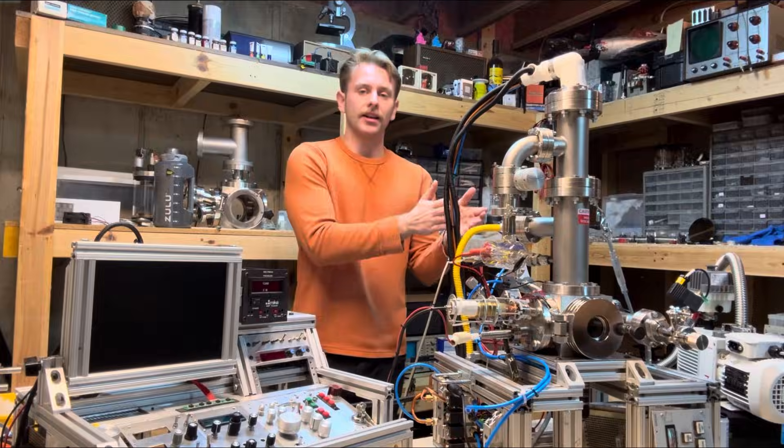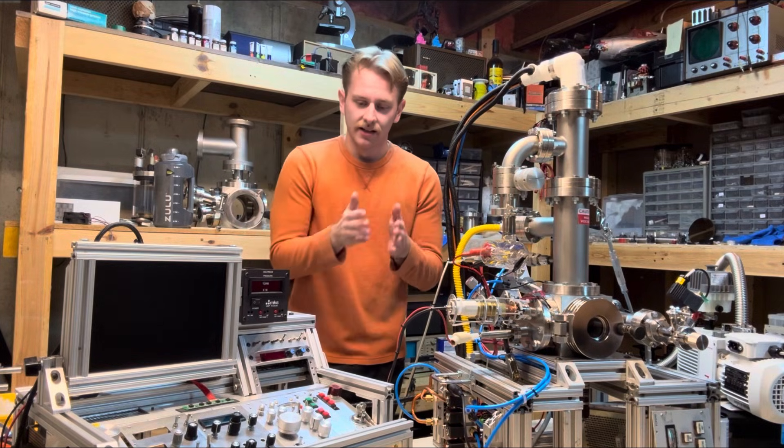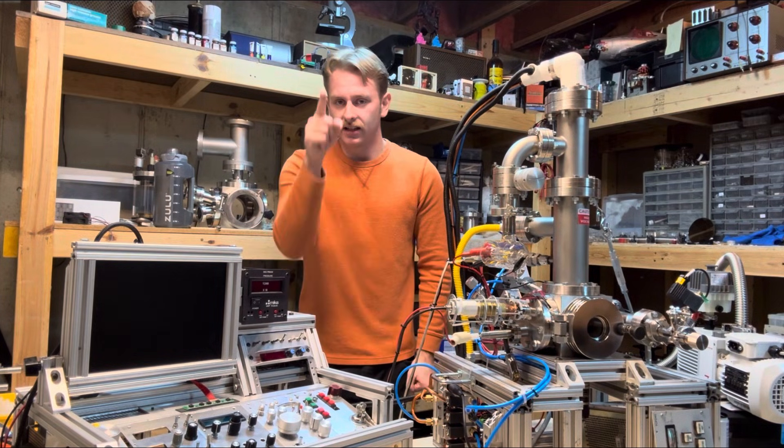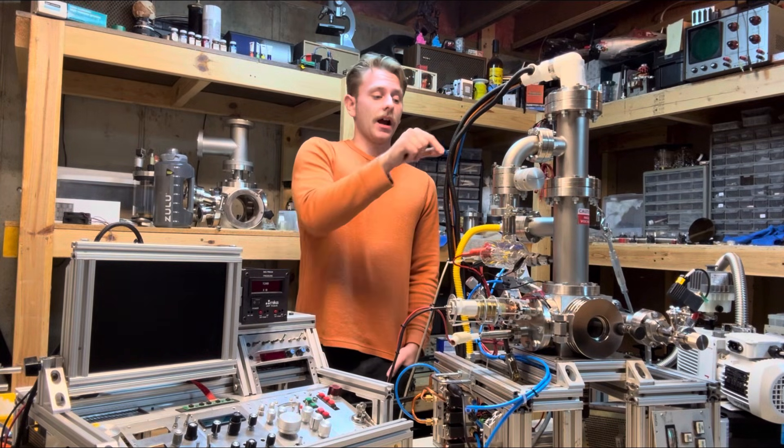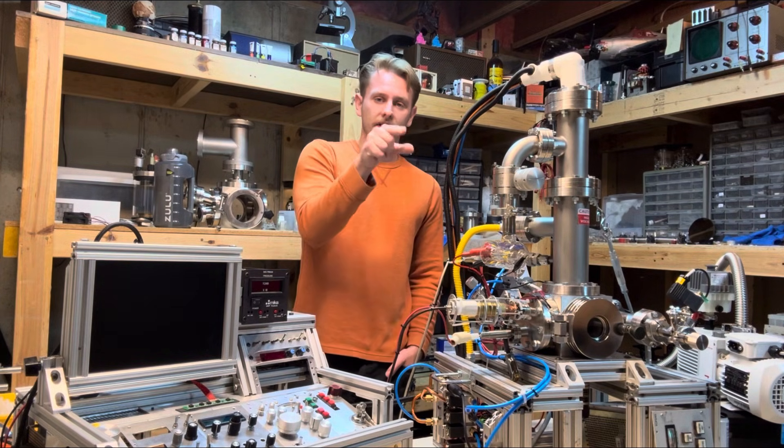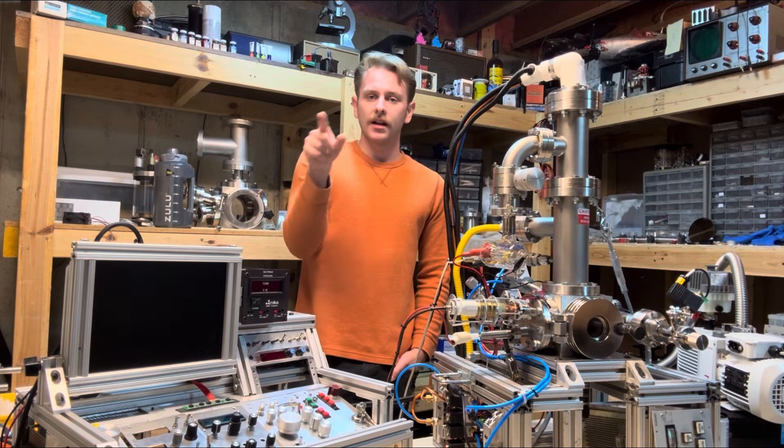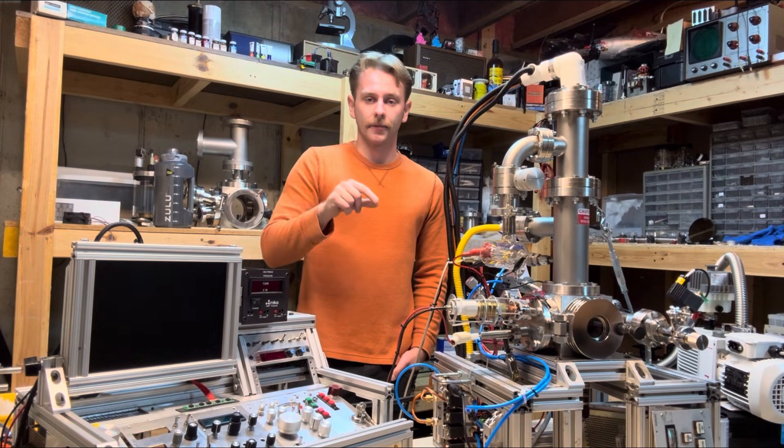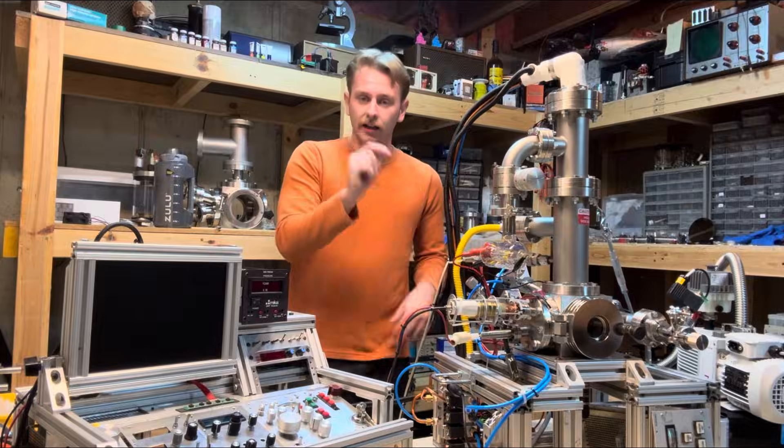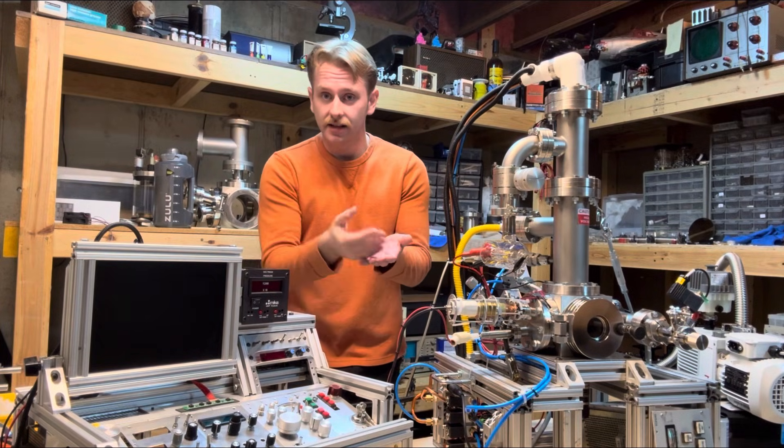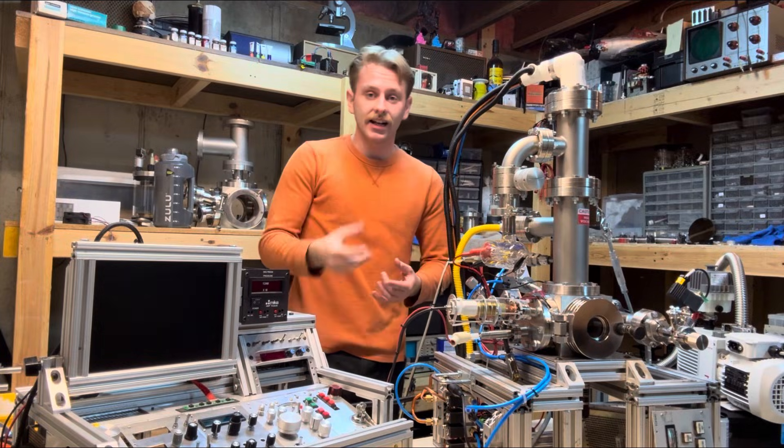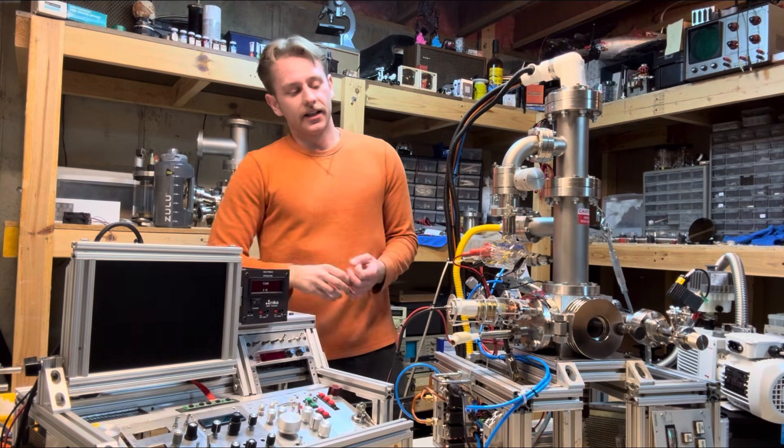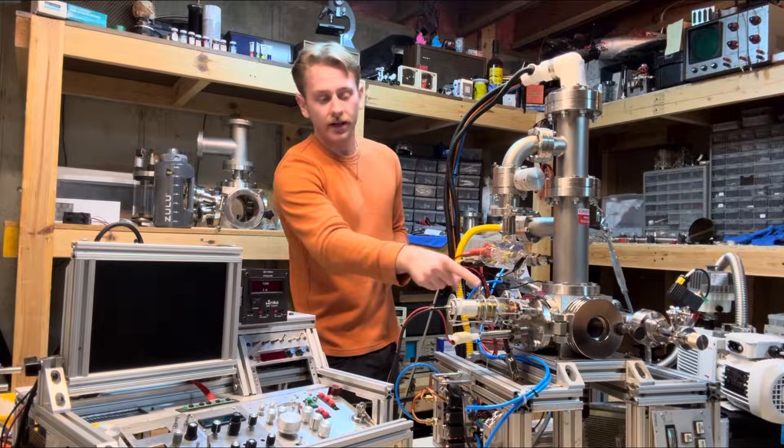And I've got these scan plates like halfway through. Now these scan plates are scanning it in the X and the Y directions. So that's why it's called a scanning electron microscope. Now what I want to do is scan them in predictable spots on this X and Y coordinate plane here. And when they're hitting that spot, these electrons are moving so fast they're scattering off the surface.